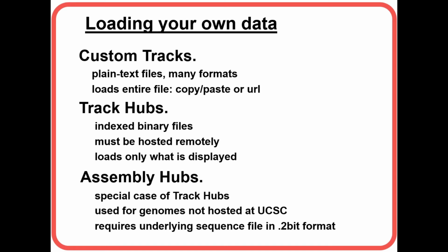To load your own data, there are a number of ways to do that. We will work with custom tracks today, show you how to load simple text files for loading your data, and there are many formats available for that. And custom tracks loads the entire file. You can either copy paste the data, or you can use a URL to the data into custom tracks.